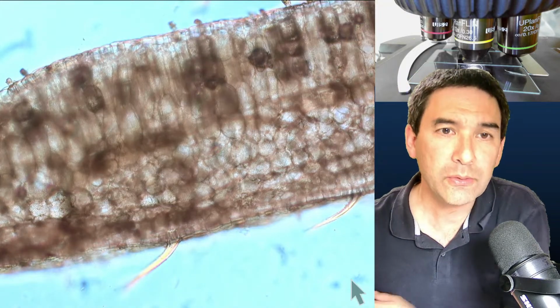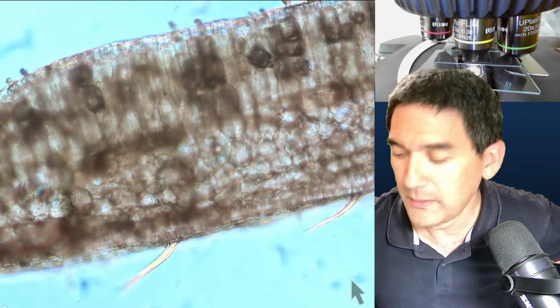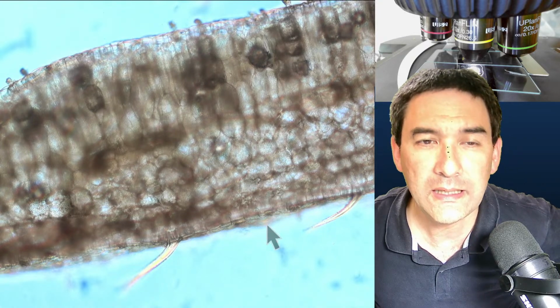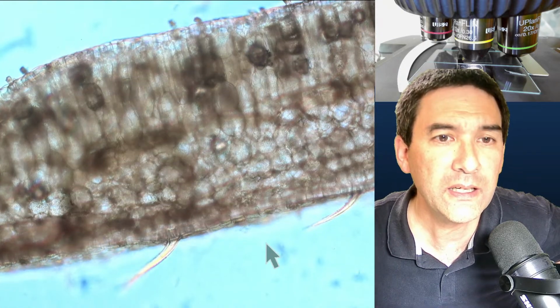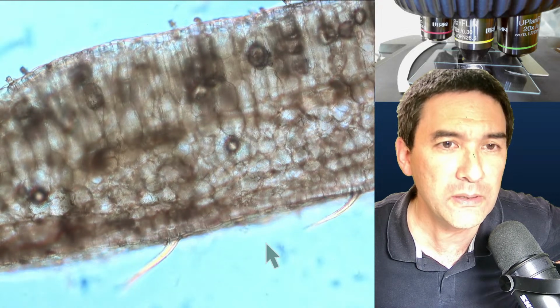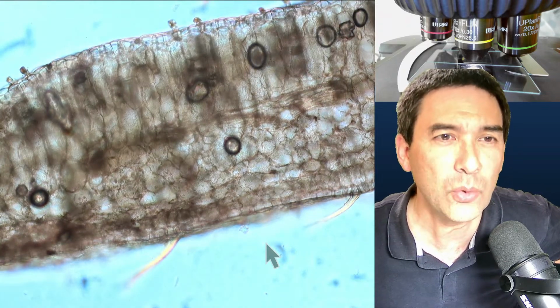And here we're now actually able to see the cells much better. If you're focusing through it, see, it's blurry, blurry, blurry, blurry. Then some cells come into focus. Just going to show you those little boxes here, just cell walls. Just have a look at those cell walls, right? And then let's wait until it goes out of focus again. And so it's out of focus again. Now the next cell layer. It actually only appears to be one cell layer, maybe one to two cell layers thick. Yeah, so I think that's okay.